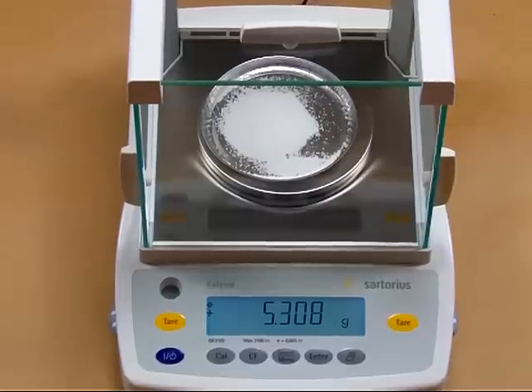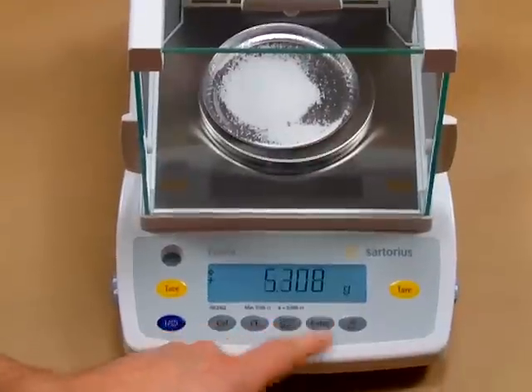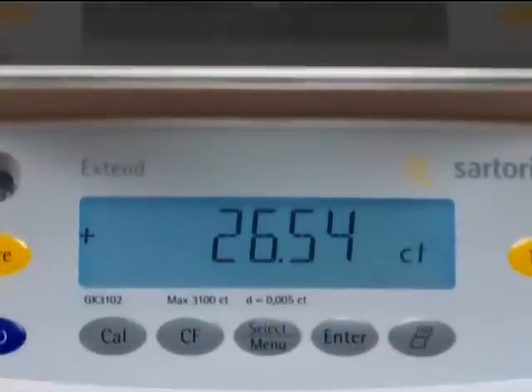We've configured this balance for five different weigh modes. You can toggle simply by pressing the enter key. We go into carats — so we have 26.54 carats.